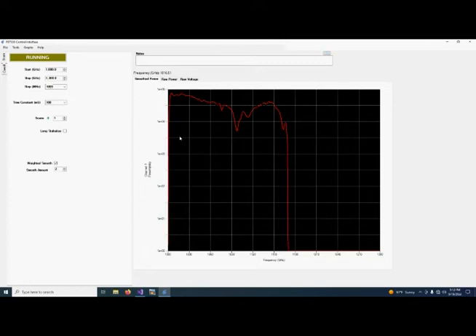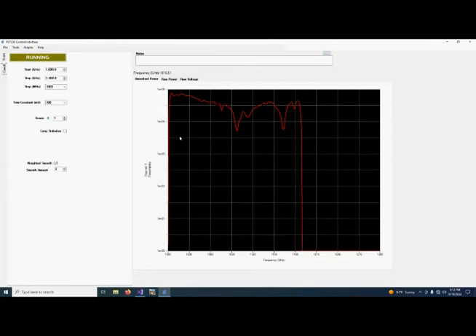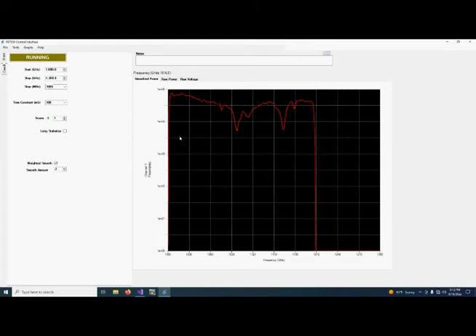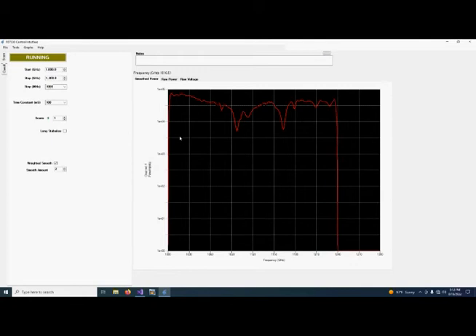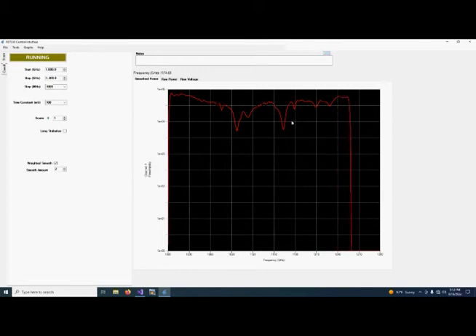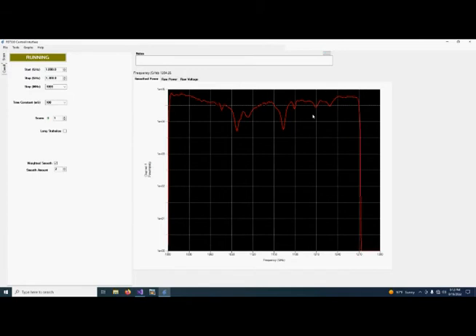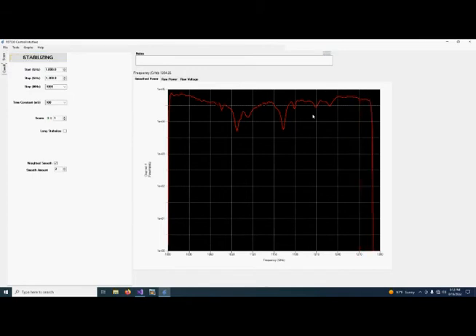Actually, it looks a little bit better than it did when there was a much stronger fringe pattern, because the spacing does not give you a little bit of residual error when you're doing the summation. So we'll let this complete a scan up and back, and we will take a look at what the data looks like.